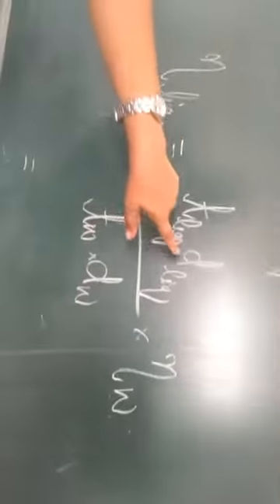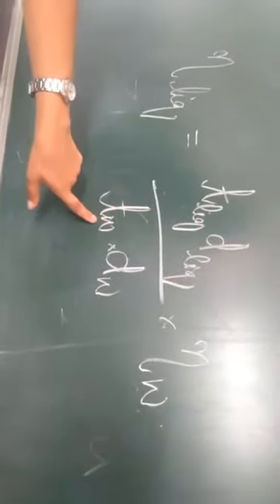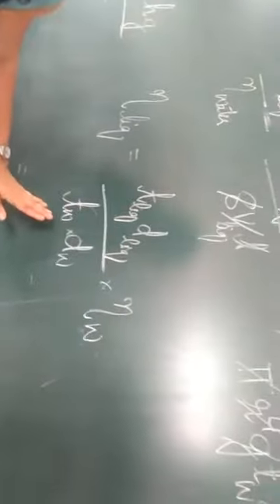That is because it has to get cancelled. Now if you write whatever is remaining, it is only the time flow for the liquid, density of the liquid, time flow of water, density of water into viscosity of water. By substituting our readings, we can get the viscosity of the liquid. So taking this reduced form, this is the viscosity coefficient, we can find out the viscosity of the liquid provided we know these details.